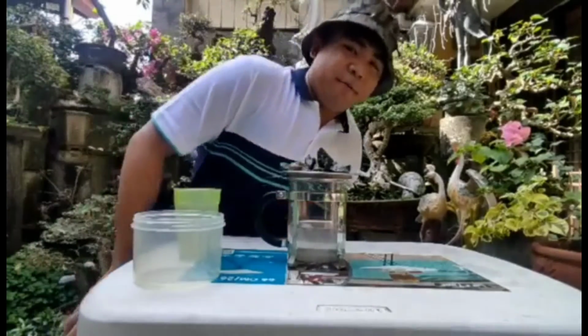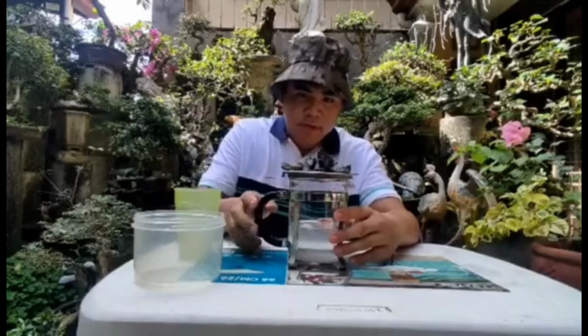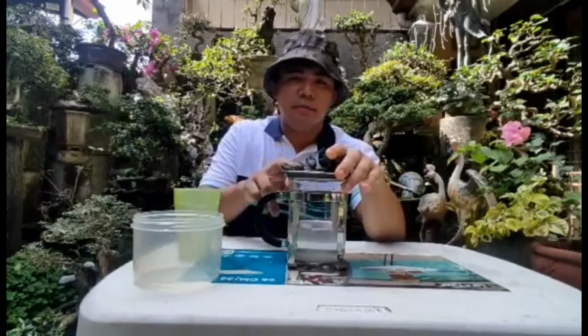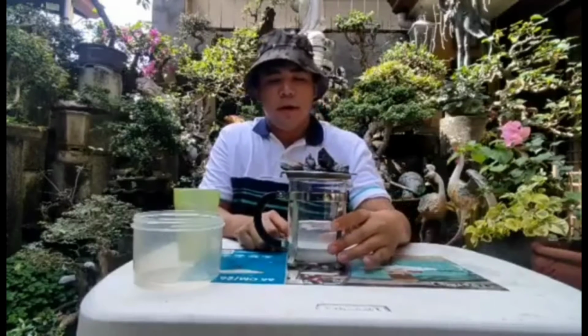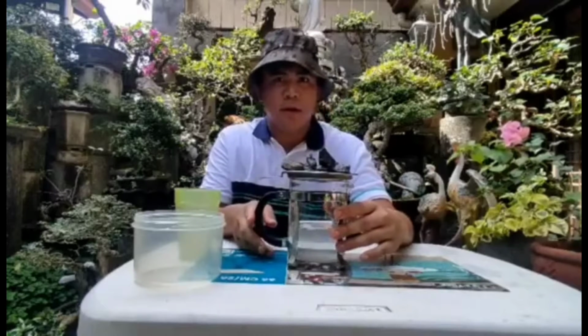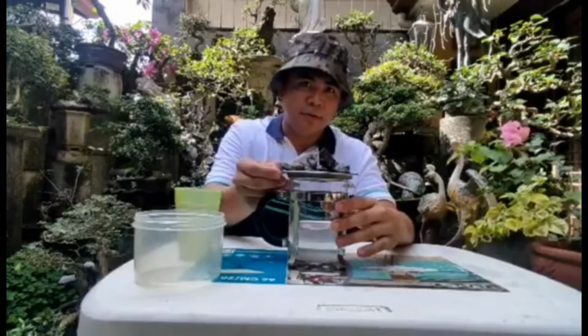I think that's about enough for 5 minutes. As we observe this procedure, the gravel remains on the sieve or in the filter, and the water in the beaker. This method that I used is called filtration.